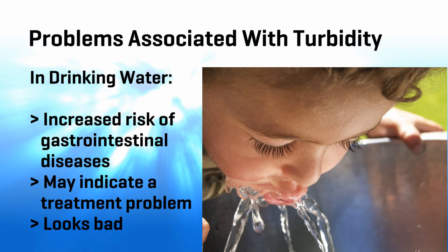Drinking water. Basically, the concern when you're in public drinking water is that turbidity is made up of a lot of little particles that are floating around the water, and they're associating and disassociating. There's a lot going on, and that's why turbidity is kind of difficult to measure, because it's really dynamic. It's kind of changing and fluctuating all the time.